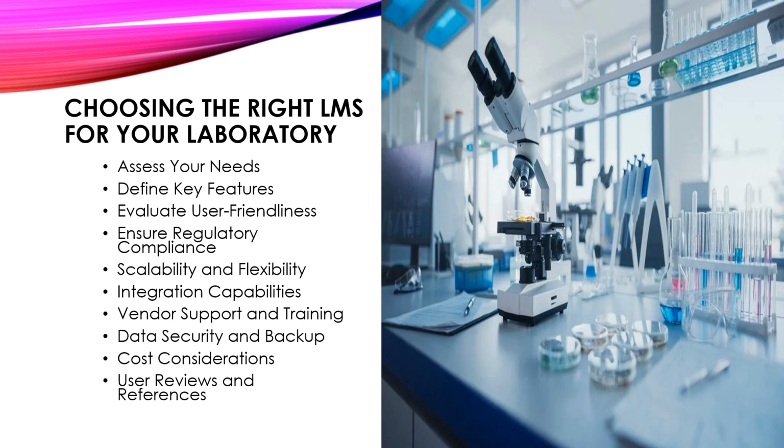The next is evaluate user friendliness. Now, the laboratory management system should be intuitive and easy to use for laboratory staff at all levels. Look for systems with a user-friendly interface and customizable workflows to match your laboratory processes.